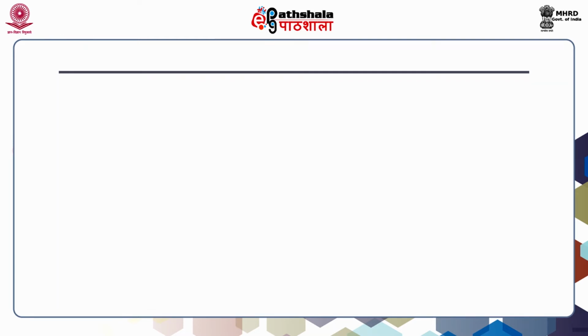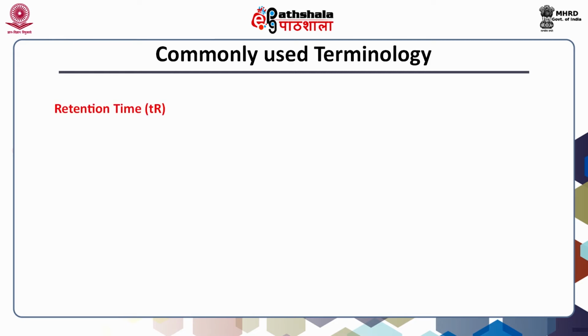Now, we have seen the stationary phase, which is very important for separating or analyzing any compound. Another thing I want to introduce to you is the commonly used terminology in gas liquid chromatography. As in the case of any other technique, here also we have some very common terminology which is used during the study of this technique, and a very important one is the retention time.